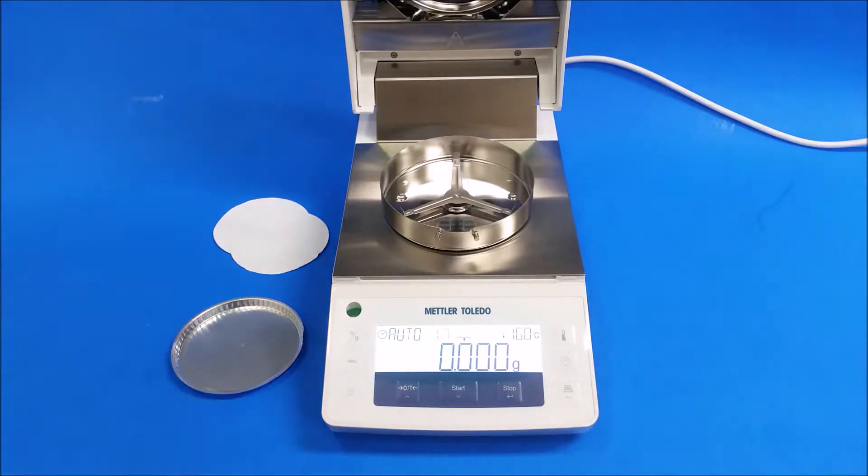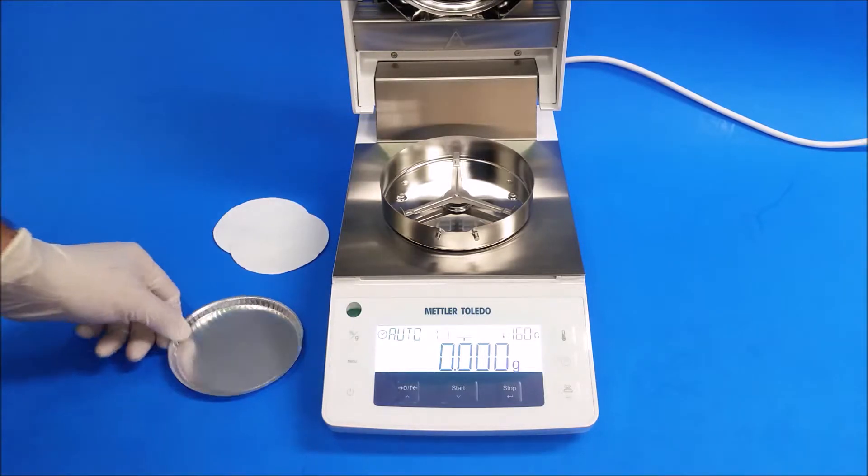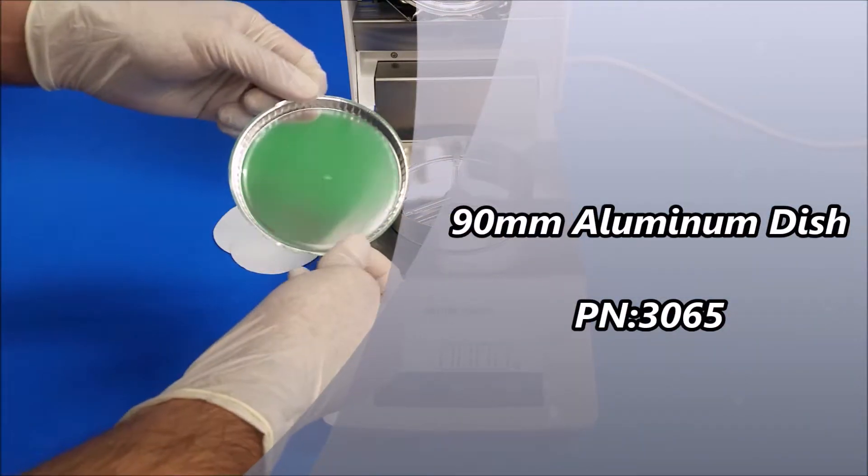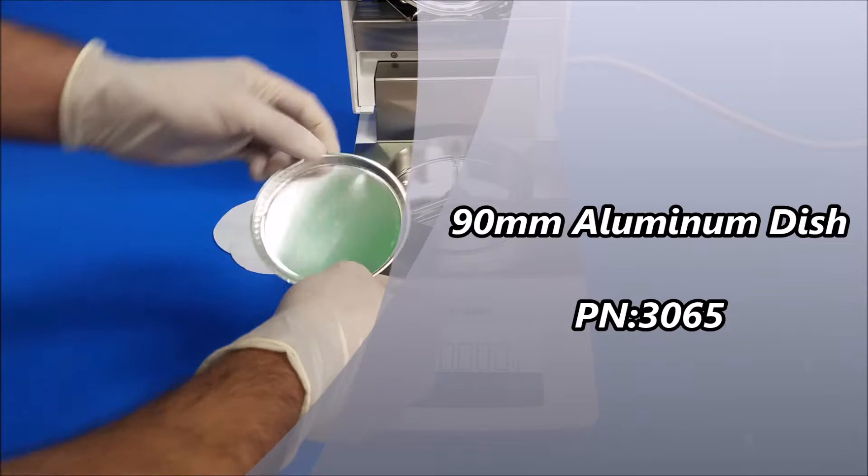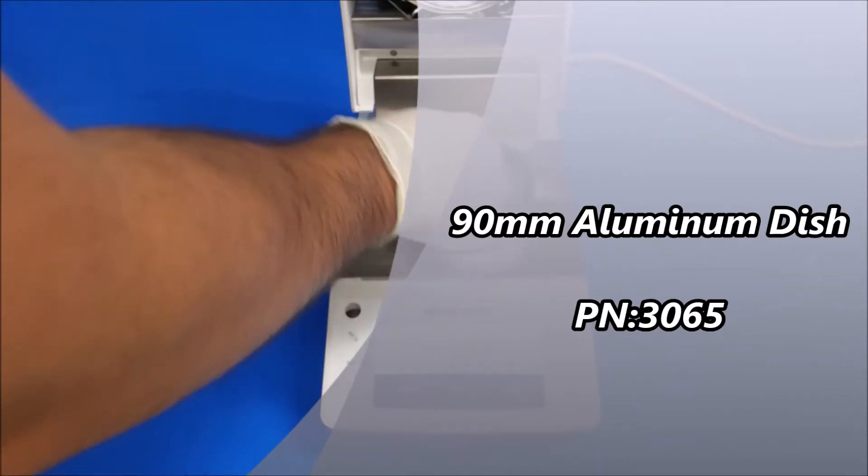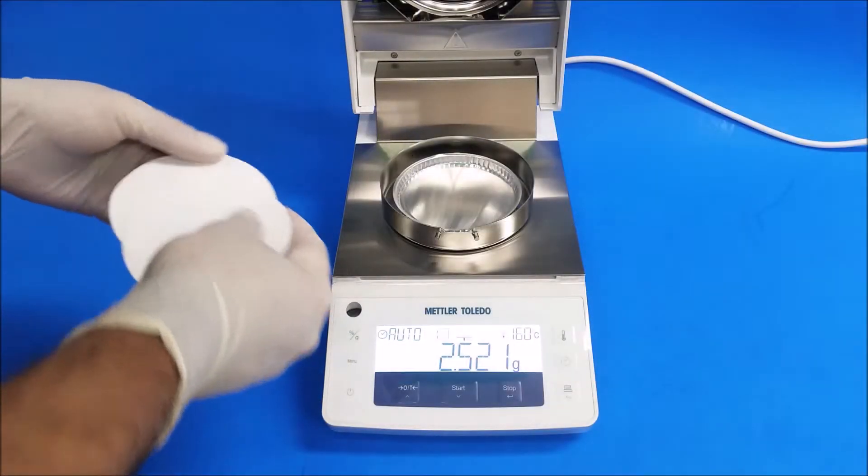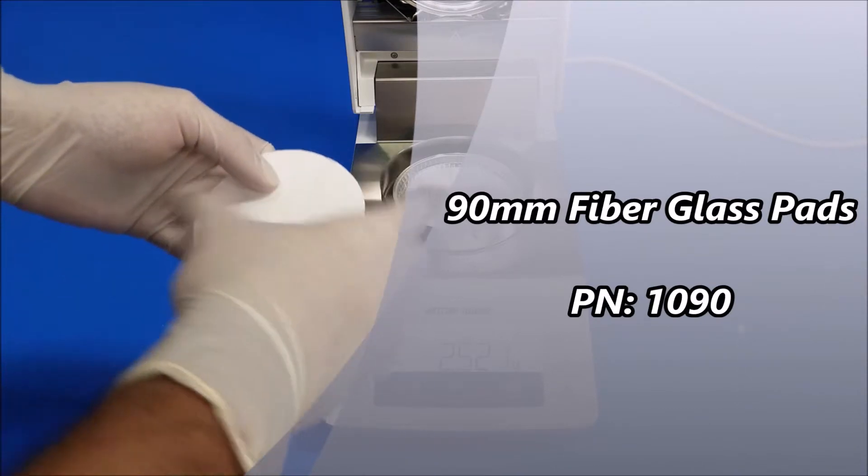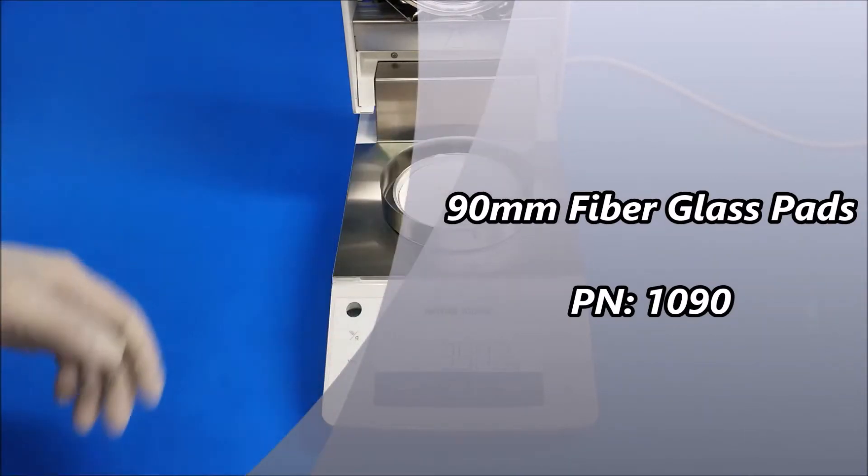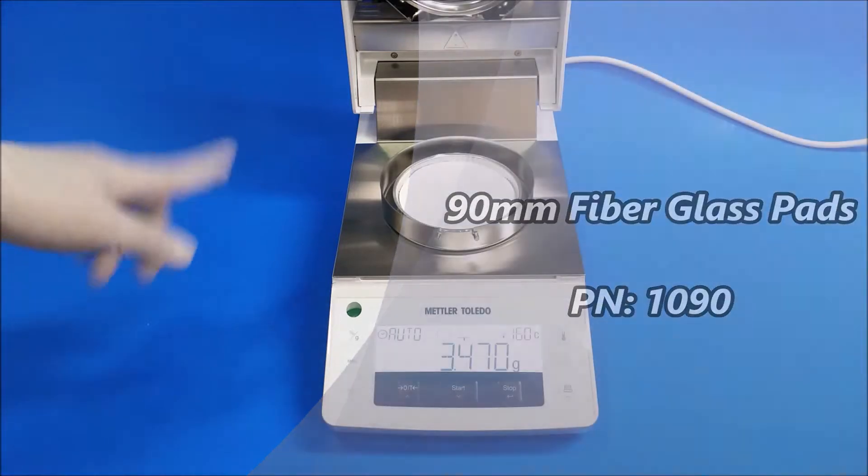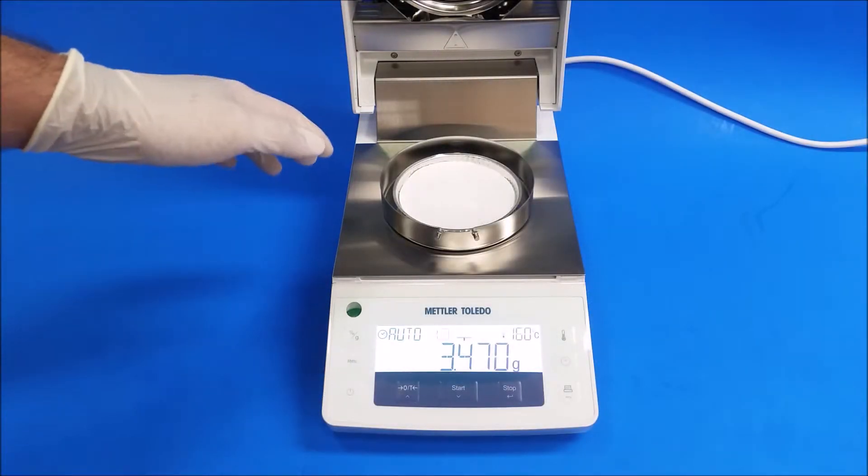I'm going to put in an aluminum dish, then my two pads. And now I'm going to press tare. We're going to make sure you press tare while the hood is down.